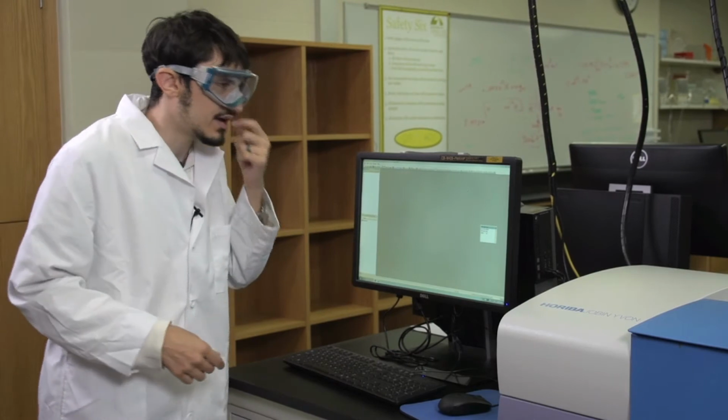Before finishing, also be sure to utilize water, the deionized water, in a cuvette in order to take a blank, which you would then subtract manually from all the intensity values, since there is no blank feature within this particular software. This concludes the day one portion of the activity. Make sure that you've saved all your files from the computer, including the Excel file that contains all of your data points for the Beer-Lambert curve.